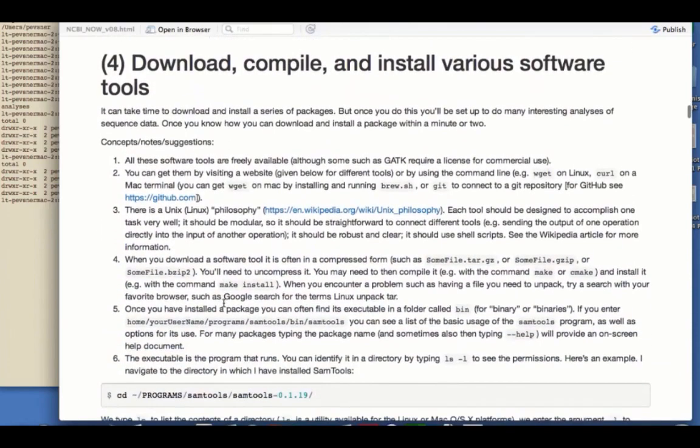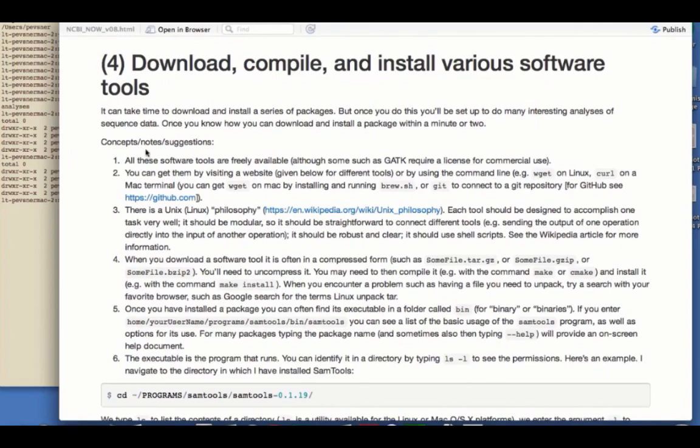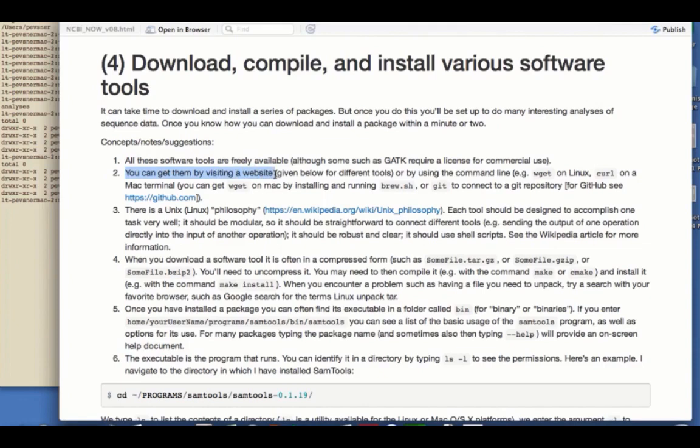Let's go now to one of the basic things we need to know how to do, and that's to download, compile, and install various software tools. It can take some time to do that, but once you learn how, you can do many of them really easily. Here are some ideas before we get started. First off, all these tools are freely available, although in some cases, such as GATK, you may need a license for commercial use. You can access these simply by going to a website, and then you can go with a command like wget on Linux or curl on a Mac to download files on the command line. Or you can, if you'd like, install and run brew.sh. You can use a Git repository to go to GitHub, a major repository of software tools. You can also download from a website, and on a Mac, the software is downloaded to your downloads directory. From there, you can move it around, unpack it, and use it as needed.